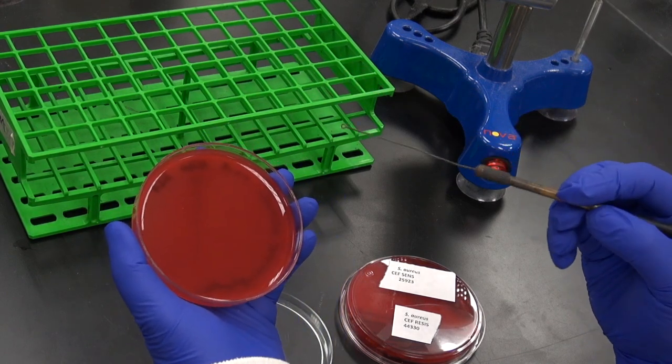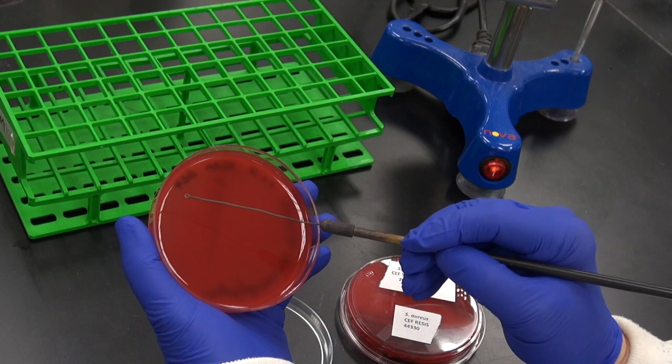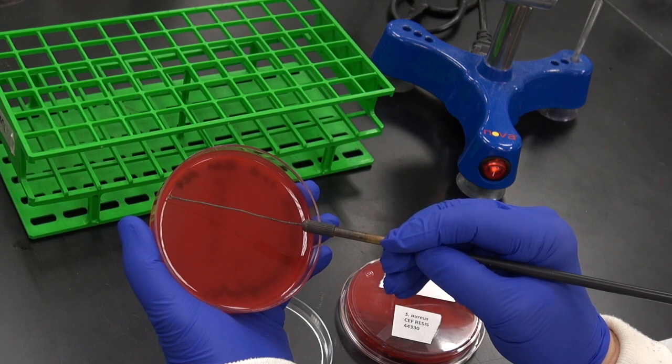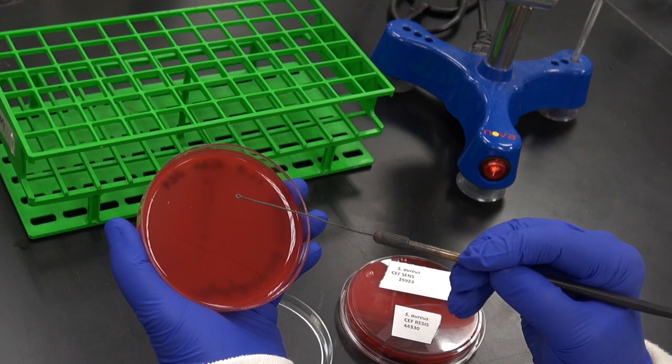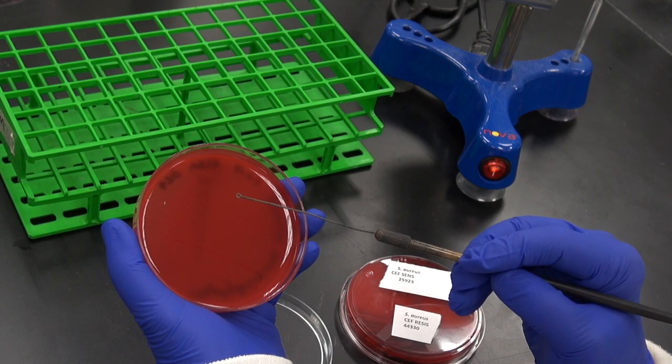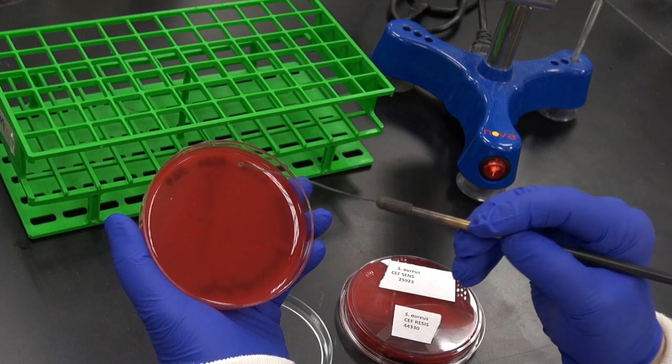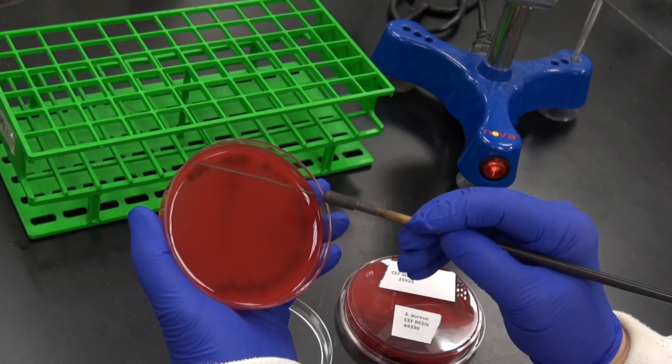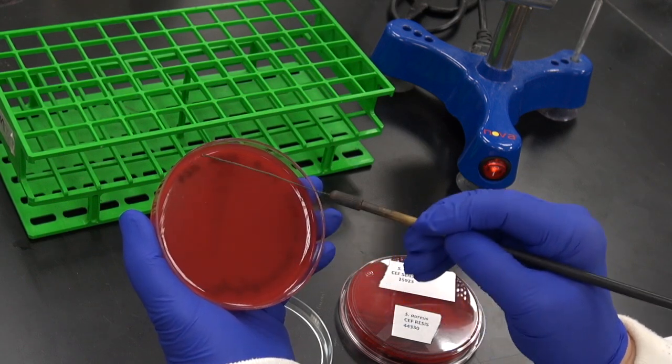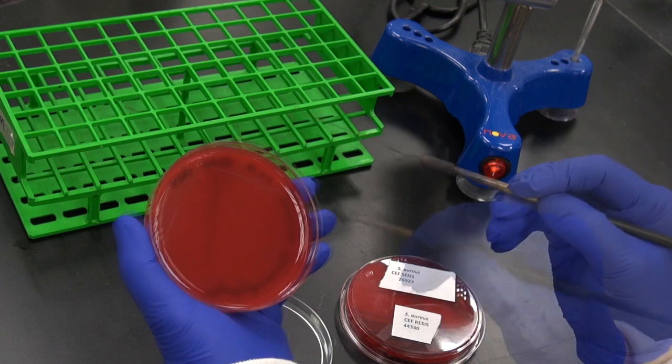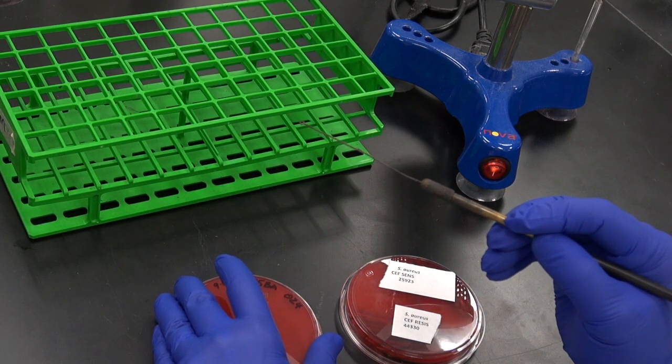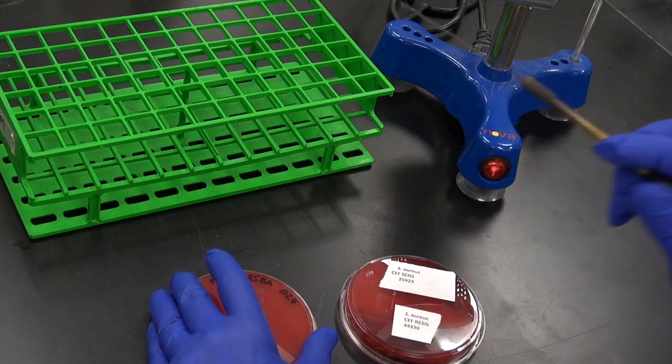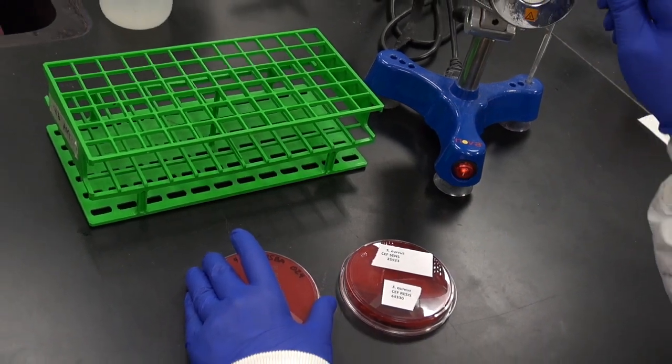Then open the fresh blood agar plate. Transfer the bacteria from the loop to the plate by making a small streak at one edge. Then spread the bacteria on one section of the plate using back and forth motions. This half-moon shaped area is called a quadrant, and this is your first quadrant. Close the plate to reduce environmental contamination.